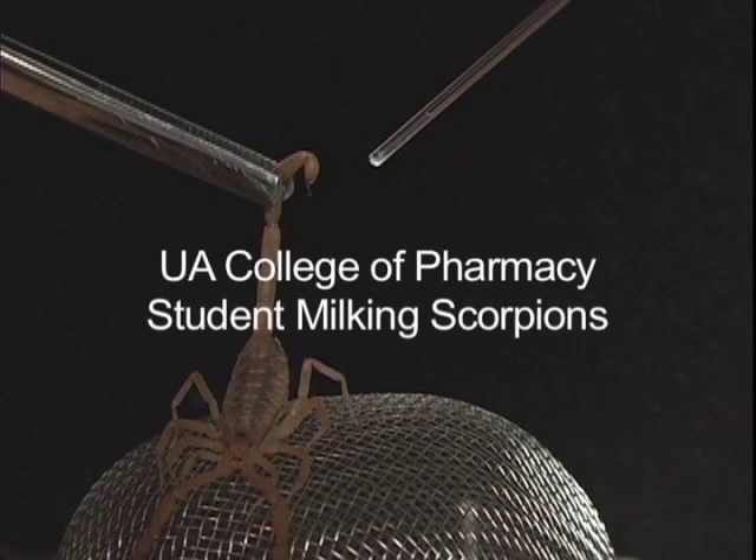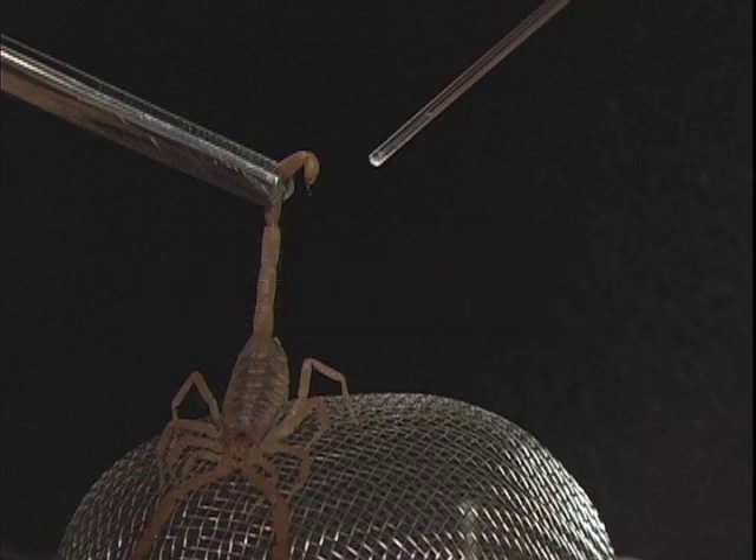I'm Dan Massey and I'm going to show you how I collected venom from scorpions for a research project. This process of collecting venom is called milking. In this video, I'm milking scorpions in my home.